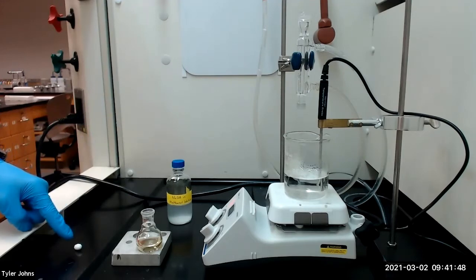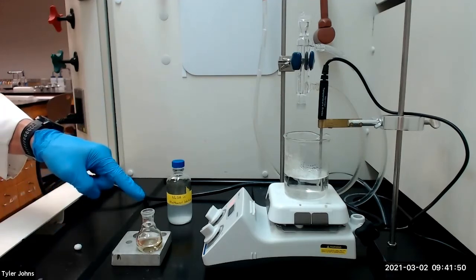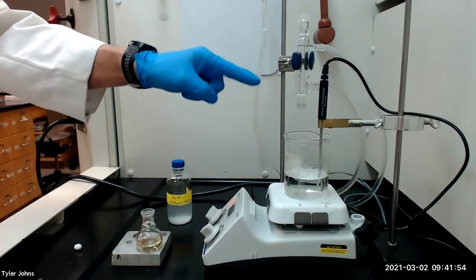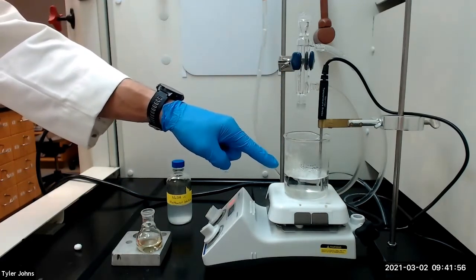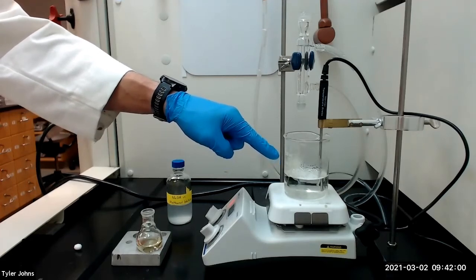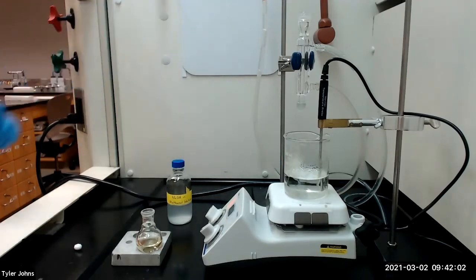We will then place a stir bar in the round bottom flask and attach the flask to a water-cooled condenser. We will then clamp the condenser so that the round bottom flask is nearly submerged in a 55 to 60 degrees Celsius hot water bath and then we will stir the mixture vigorously for 30 minutes.